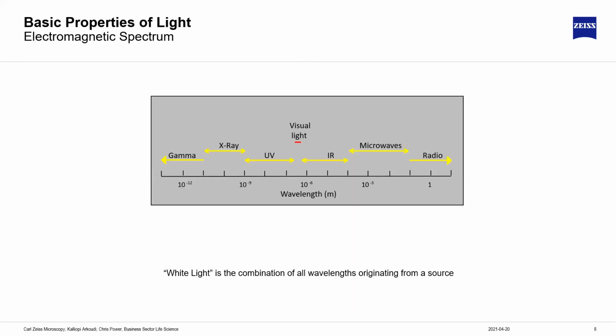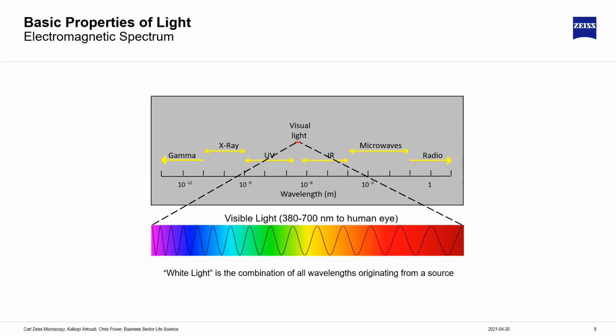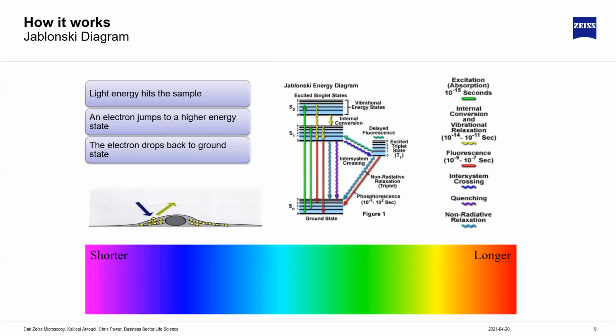Now, just to understand how things work in terms of fluorescence, here I have the electromagnetic spectrum in terms of what you've probably seen at school, and we care about the tiny part in the middle, the visible part of the spectrum. But what's significant here is the energy gradient depicted within the spectrum. So over here on the left, you tend to have higher energy, and on the right, lower energy. I always think, over on the left, you have nuclear weapons. Over on the right, you have jazz radio. It's very definitely a high to low energy situation here. And George Stokes realized how that worked and began to describe it.